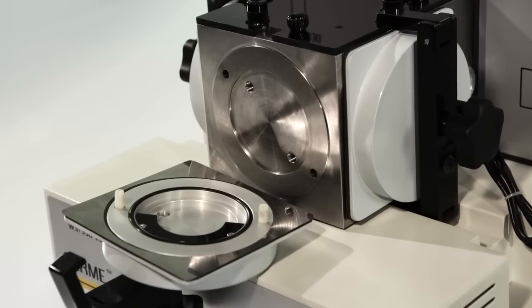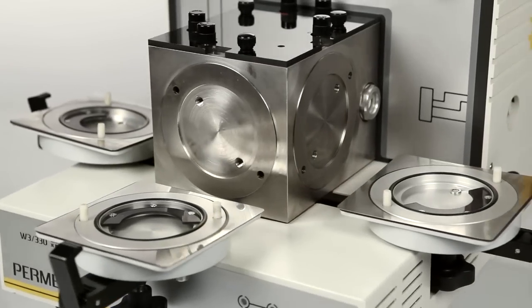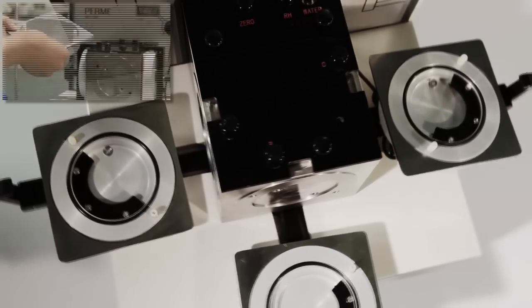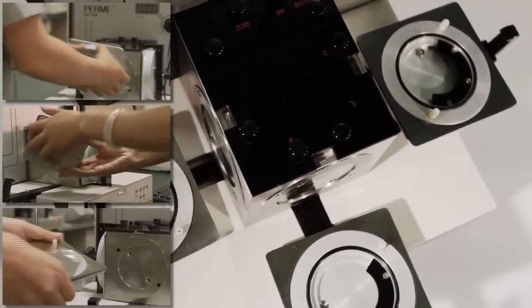It can carry out three independent tests within one unit and measure three, the same or different samples under the same test condition simultaneously.